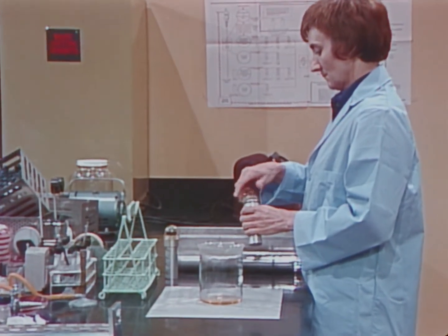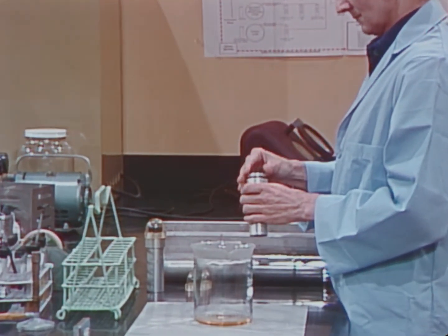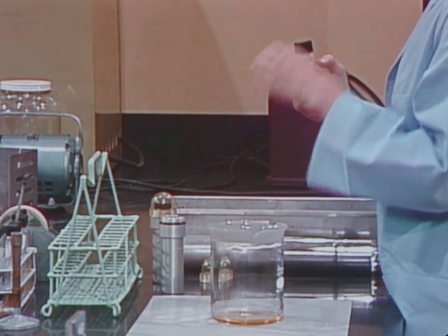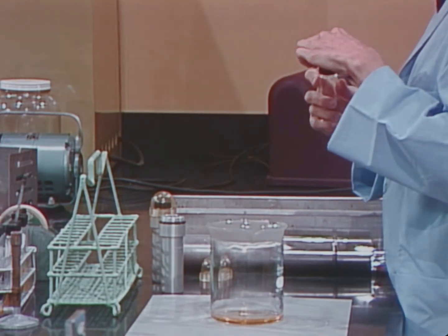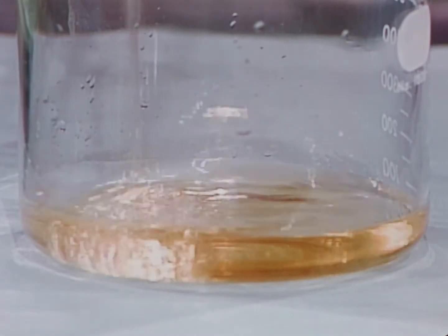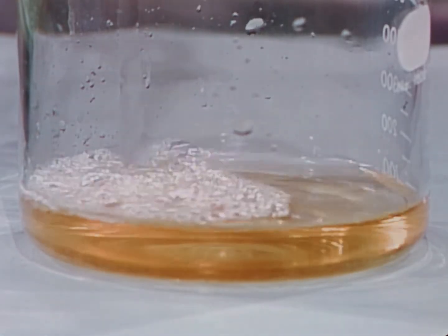First, consider the aerosol composed primarily of large droplets. These large droplets settle in a relatively short time and contaminate work surfaces or skin. The droplet nuclei found in the second type of aerosol form as a result of almost instantaneous dehydration.